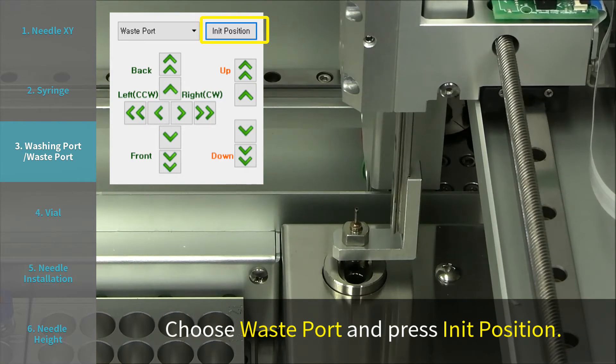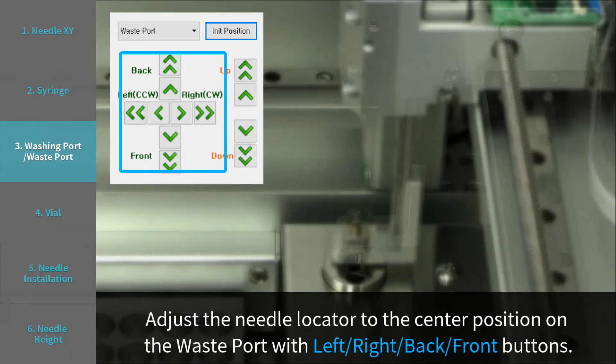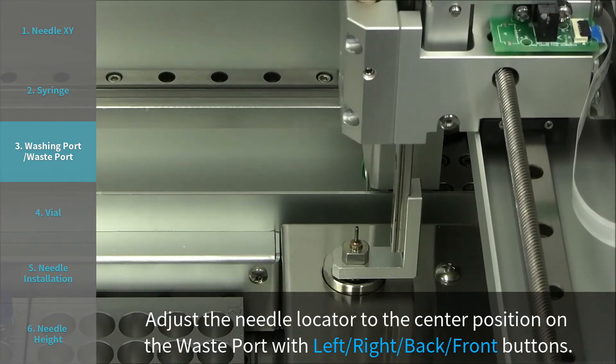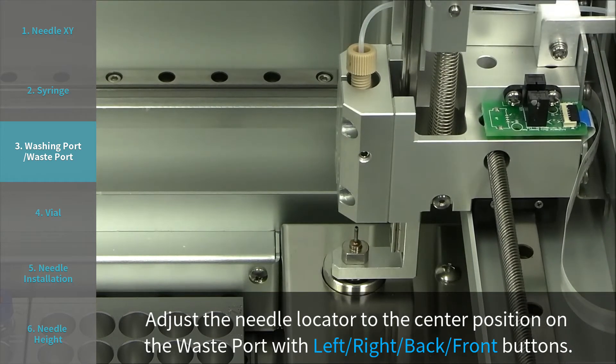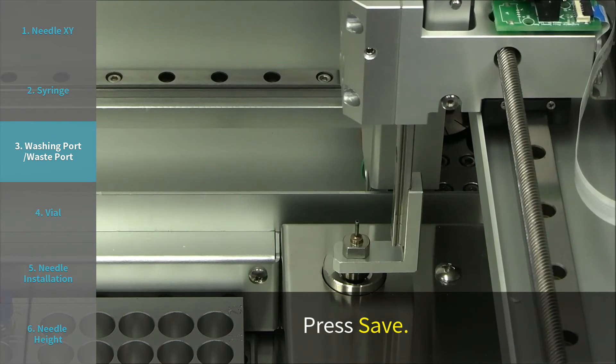Choose waste port and press INIT position. Adjust the needle locator to the center position on the waste port with left, right, back, and front buttons. Press save.